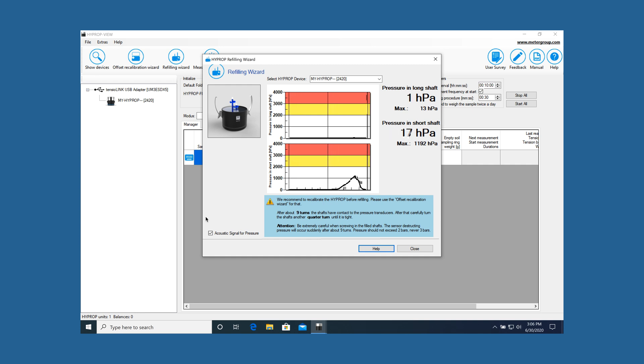This prevents air from entering the tensio shaft. If air enters the shaft, the degassing process must be repeated.